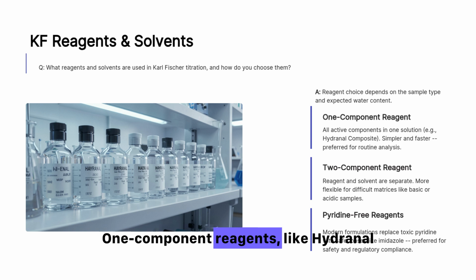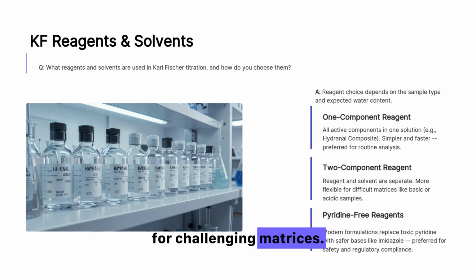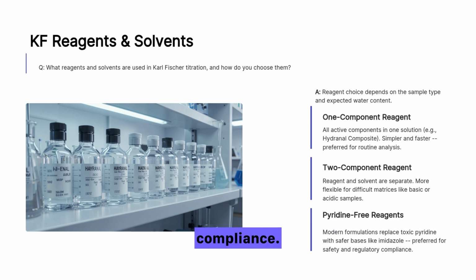In Karl Fischer titration, reagent choice is crucial. One-component reagents, like Hydranal Composite, simplify routine analysis. Two-component reagents offer flexibility for challenging matrices. Modern pyridine-free formulations using safer bases like imidazole enhance safety and regulatory compliance. Choose based on sample type and expected water content.